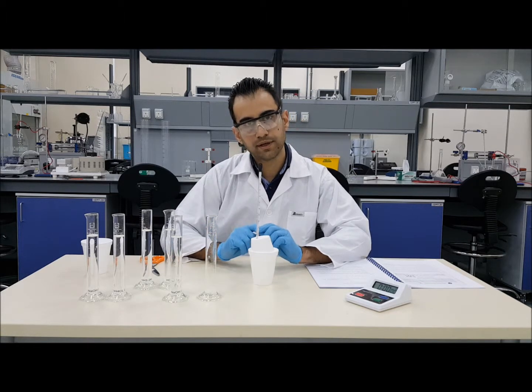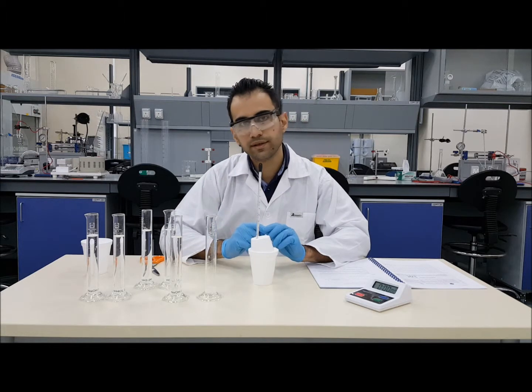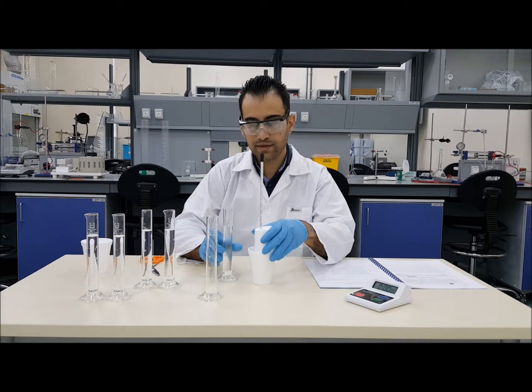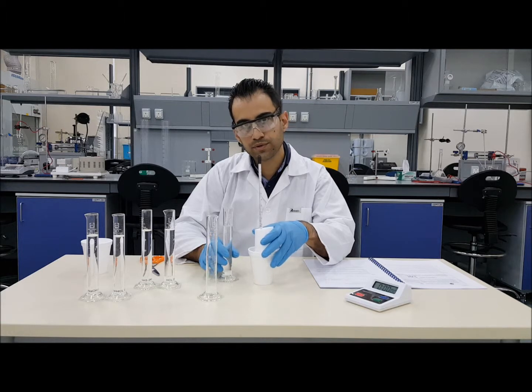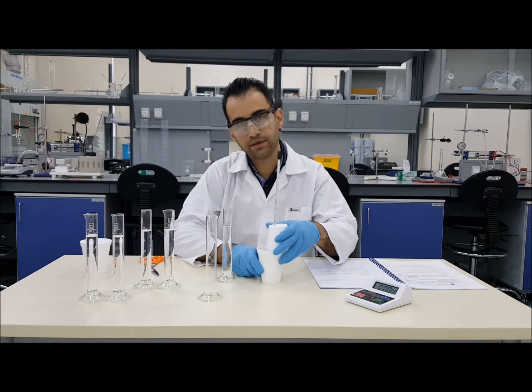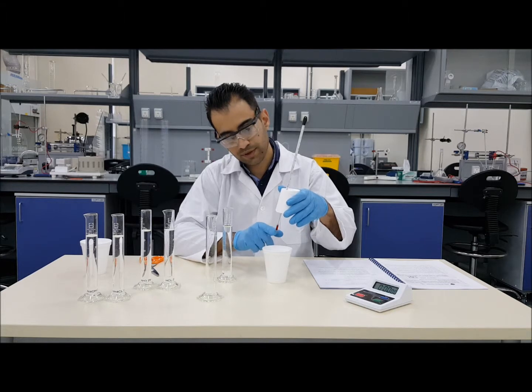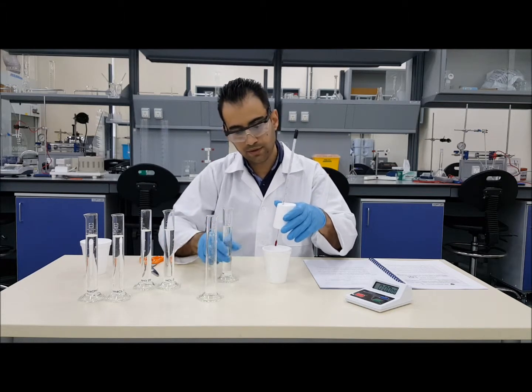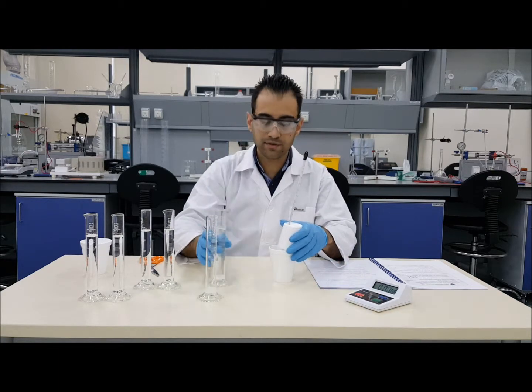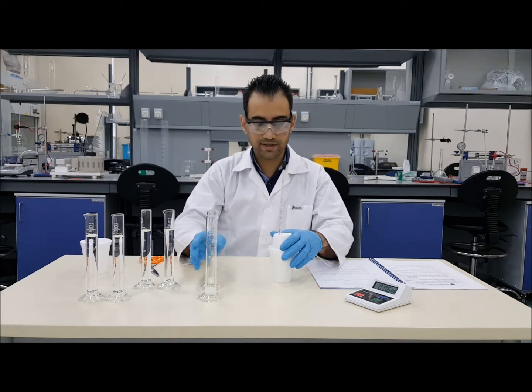As you add the next chemical, you will need to start the timing immediately and get a temperature reading every 30 seconds. So I'm going to do that. Normally you work in a group, so you can ask somebody to start the stopwatch for you as you add the chemical. Always be careful when you remove the thermometer, because you will have chemicals which might drop on the workplace you are in. So I'm going to start with the timing now and add the chemical. Always keep your face away and cover it as quickly as possible.